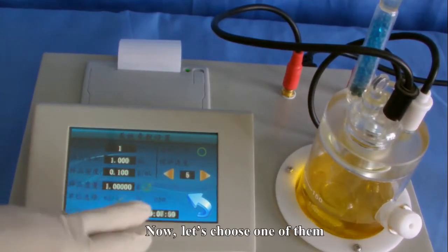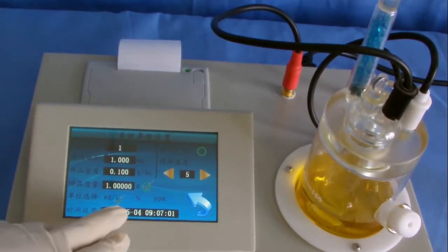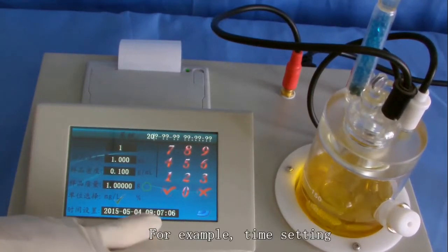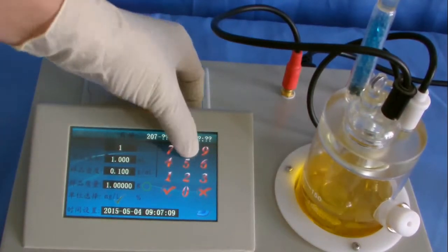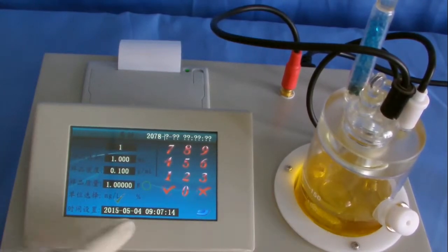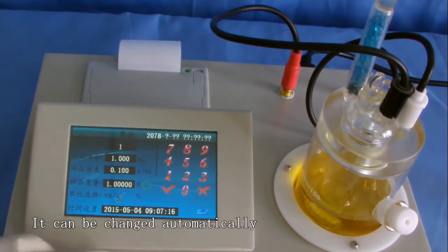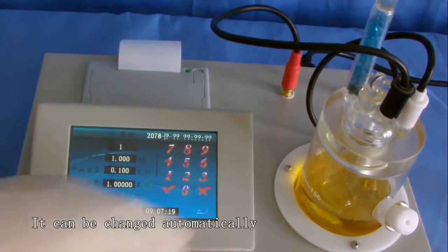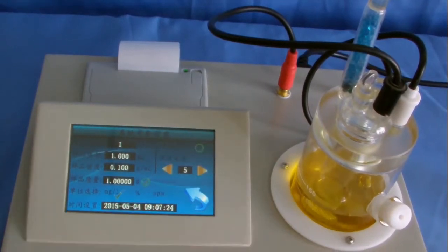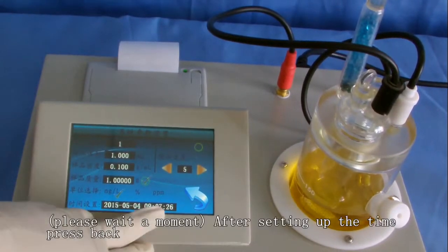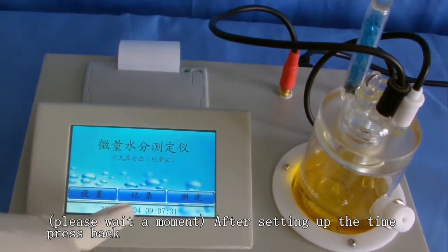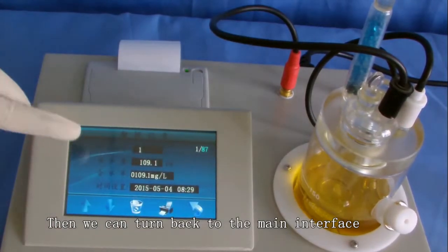Now, let's choose one of them. For example, time setting, then you can input time and press ok. After setting up the time, press back, then we can turn back to the main interface.